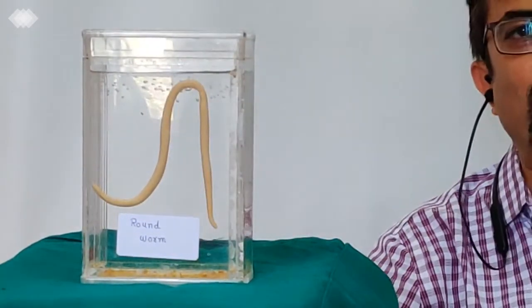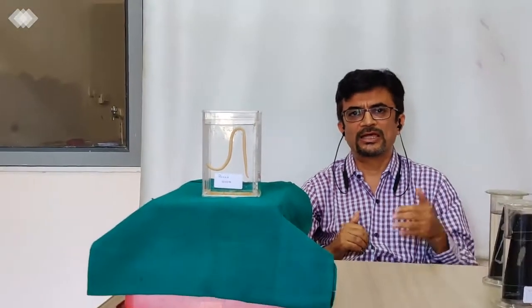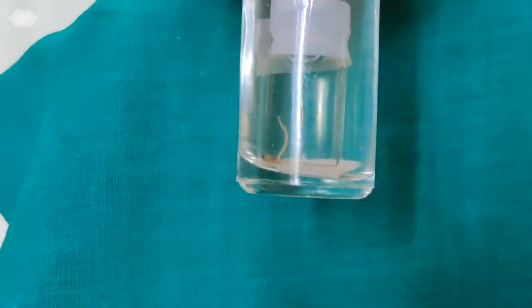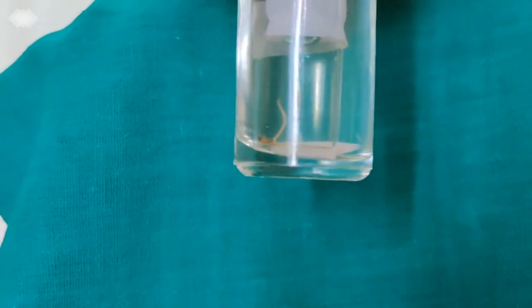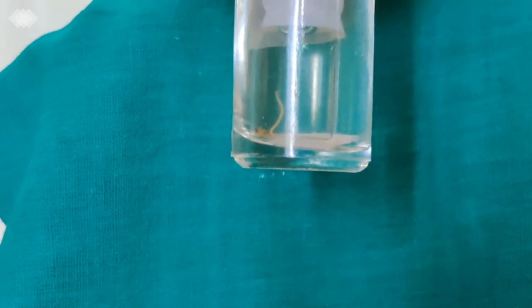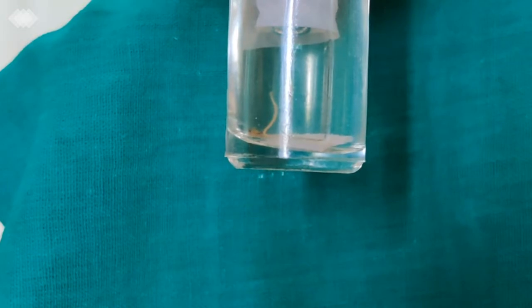Other than this, there would be other nematodes like hookworm and the threadworm. If you want to see it, I will have to zoom it because they are very smaller, around 1 cm of the size. Now you can see this. This is hookworm. The size is around 1 cm and it would remain attached to the intestine and that would suck the blood. One of the common cause of anemia.